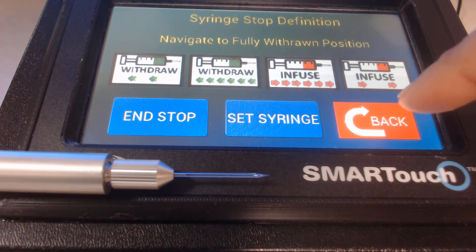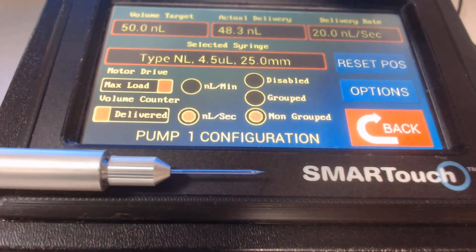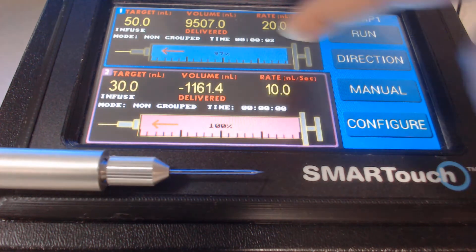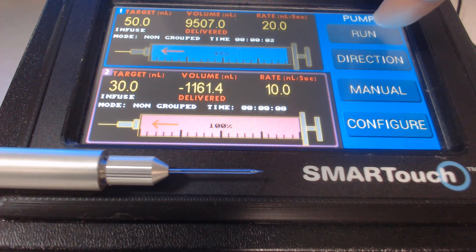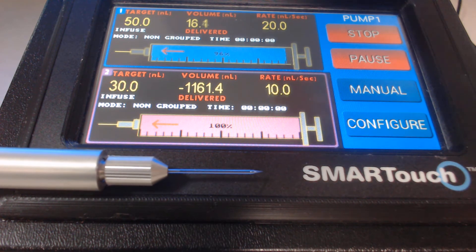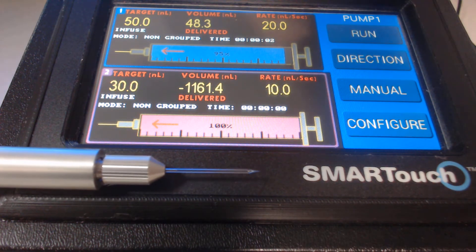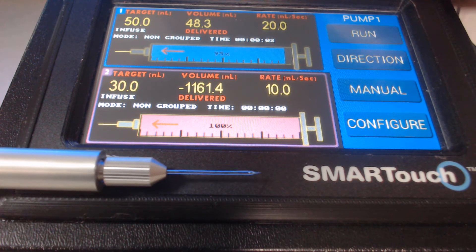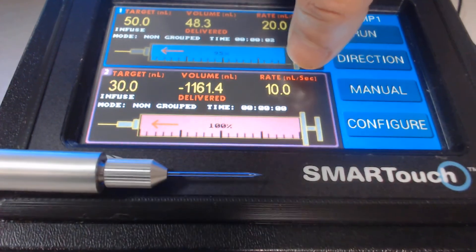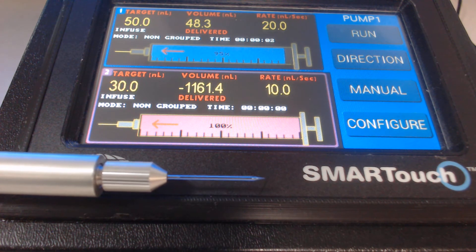To inject your sample, press the back button to return to the main screen, press back again — your parameters for channel 1 are set. Press the run button to inject at your desired volume and rate. You can then unplug the pump from the back and plug it into channel 2 at the desired target volume and rate, avoiding the need to navigate through many screens to reach the injection step.